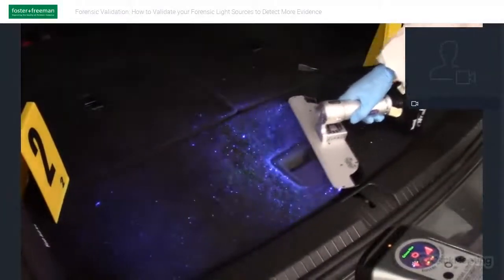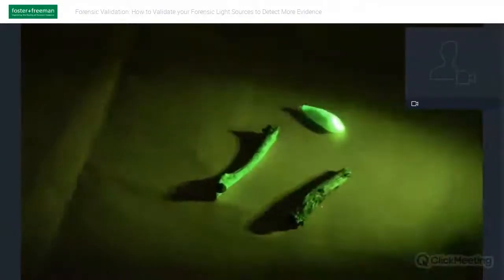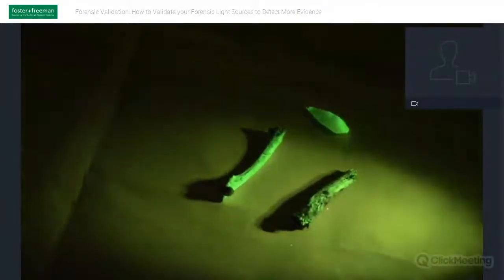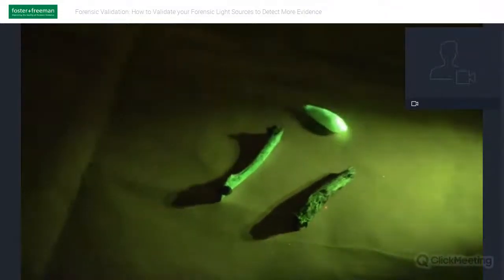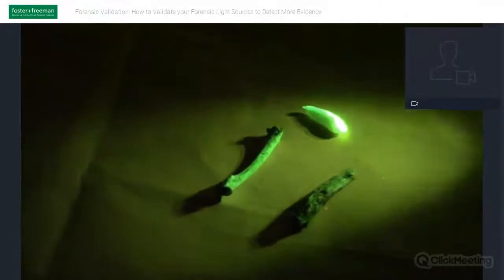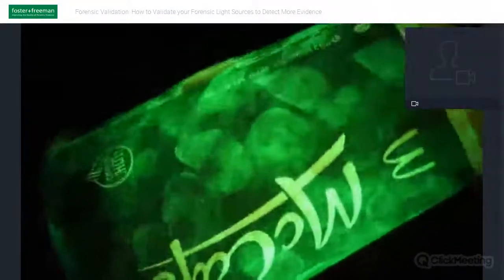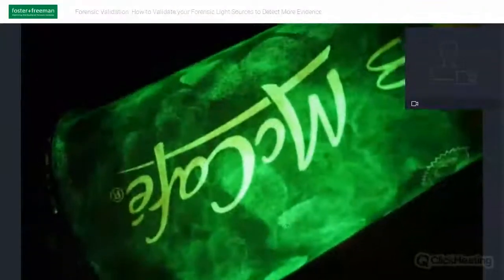marks, and tool marks or surface impressions. UV fluorescence is widely used for the examination of evidence. UV light is not visible to the naked eye, but the UV fluorescence is emitted in the visible part of the spectrum. Therefore, we can often view this type of fluorescence without the need to wear any filtered goggles. We can also use UV in secondary applications to allow us to improve our visualization of different evidence types.